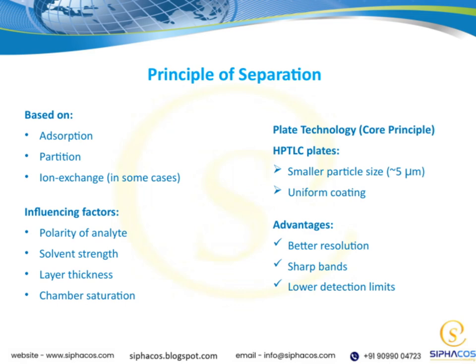Moving on to the principle of separation, it primarily relies on mechanisms like adsorption, where analytes stick to the stationary phase, partition, where compounds distribute between phases, and in some cases, ion exchange, which involves the exchange of ions between the analyte and the stationary phase.